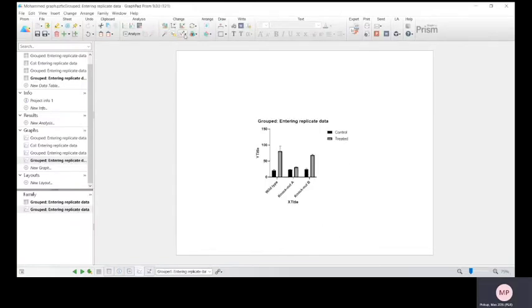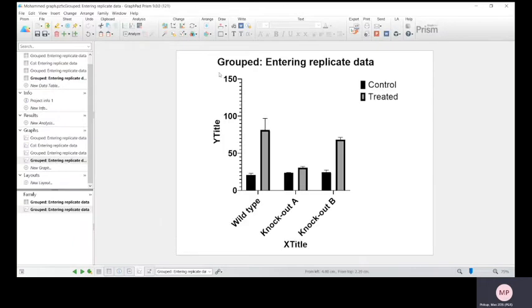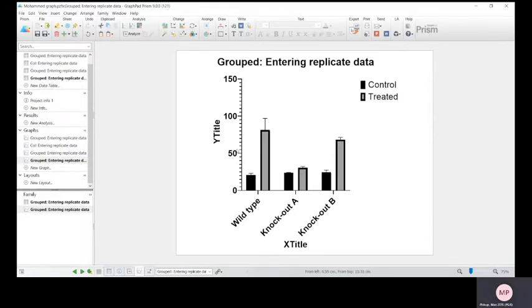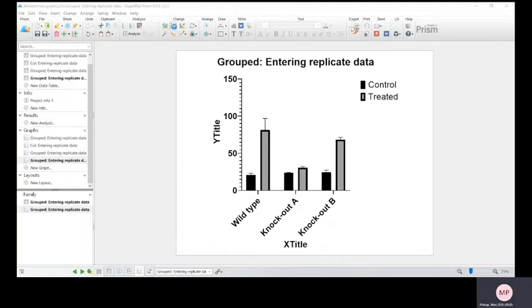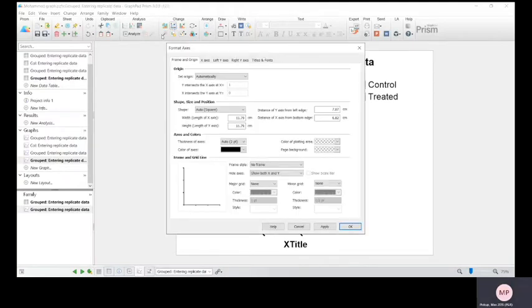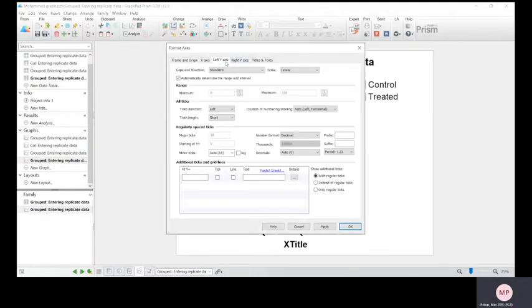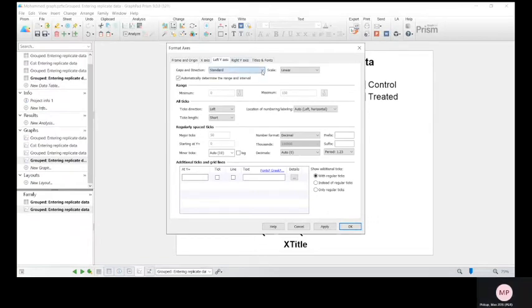If I want to break around 40, whatever it is, what we do is click this one, this format axis. If you go to left y-axis, gaps in direction, and then you can choose how many segments you want.